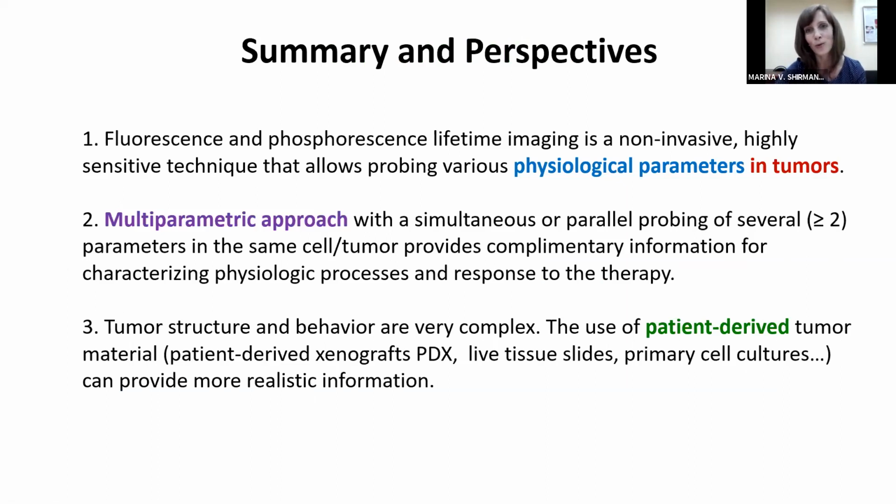to, as I showed you, probe different physiological parameters: cellular metabolism, oxygenation, apoptosis, viscosity, and some others if you have an appropriate sensor. A multiparametric approach with simultaneous probing of several parameters in the same cell or the same tumor provides complementary information about the physiology of the tumor and response to therapy.